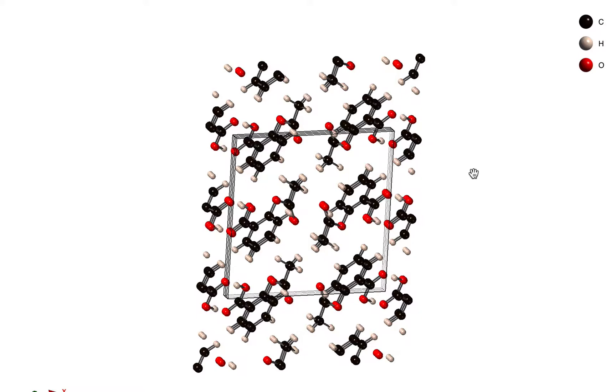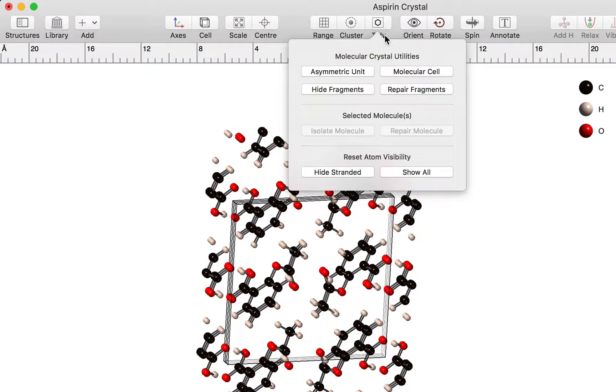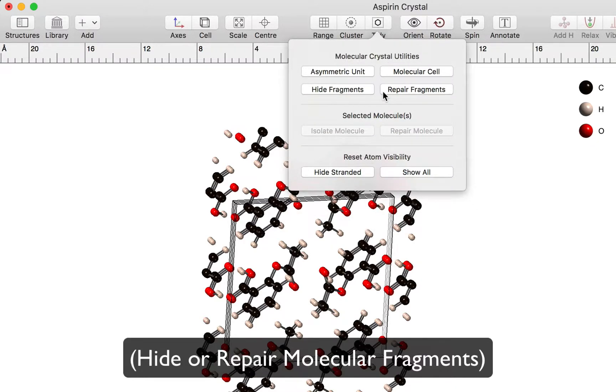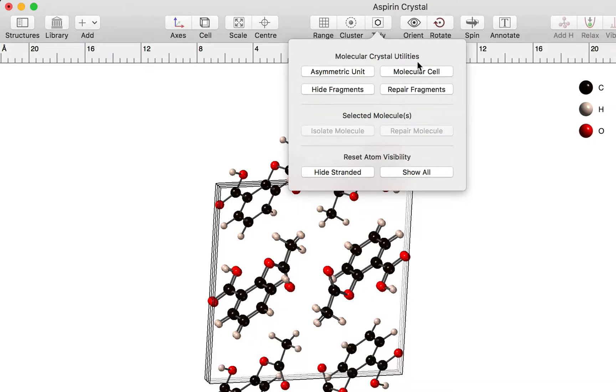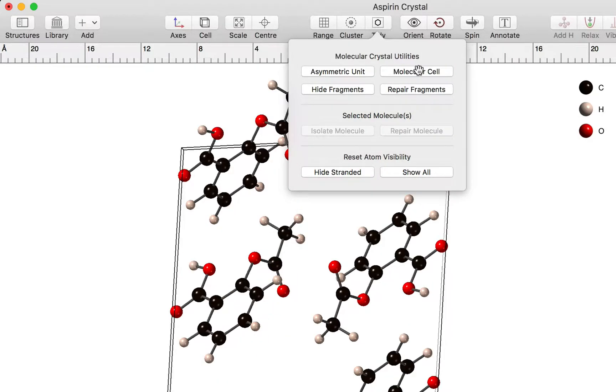What to do here? Well you can go back to the tidy button. You can repair those fragments that will actually expand the plot range and give you intact molecules that extend further out, or we can simply hide the fragments. I'm going to go back to our molecular cell view for the moment.